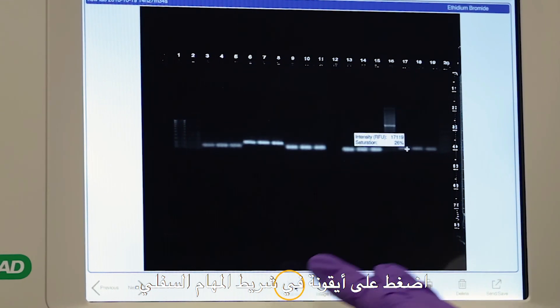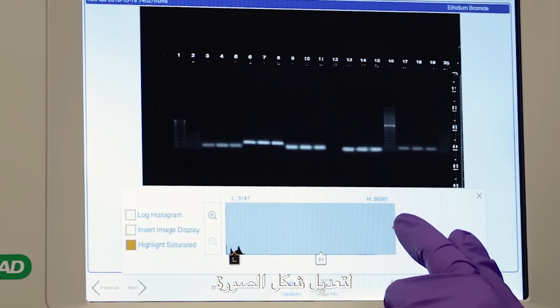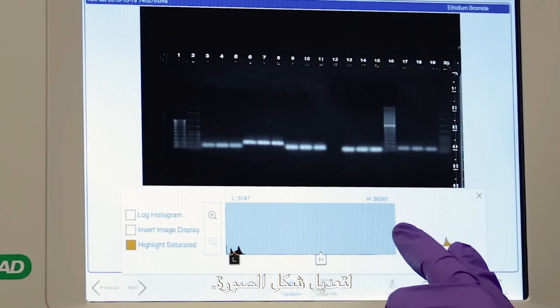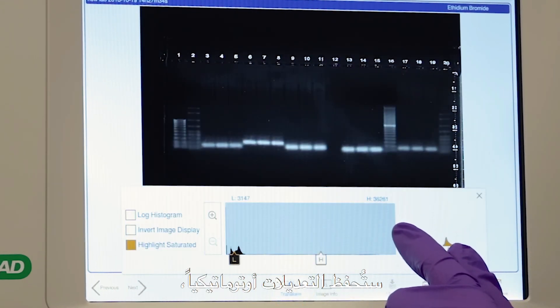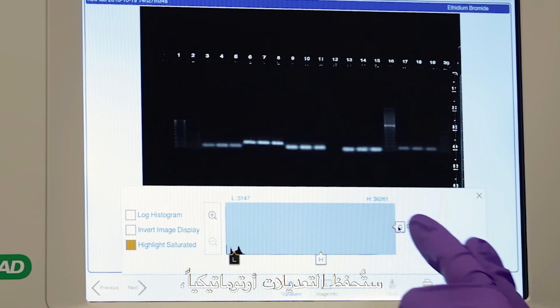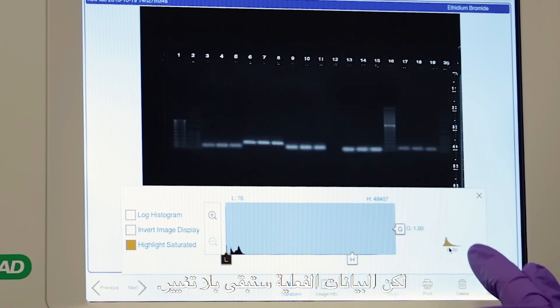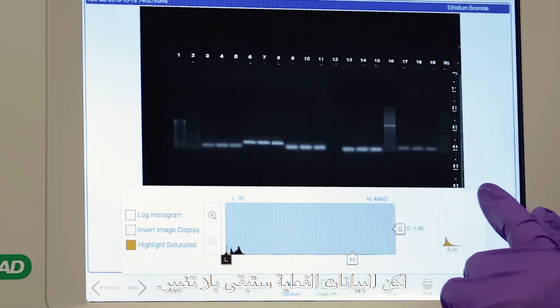Tap the transform icon in the lower toolbar to adjust image appearance. The adjustments will automatically be saved, but the actual data will remain unchanged.